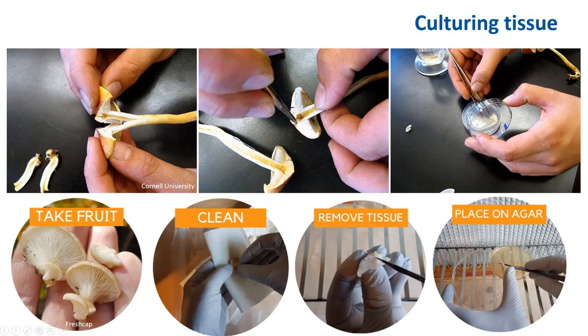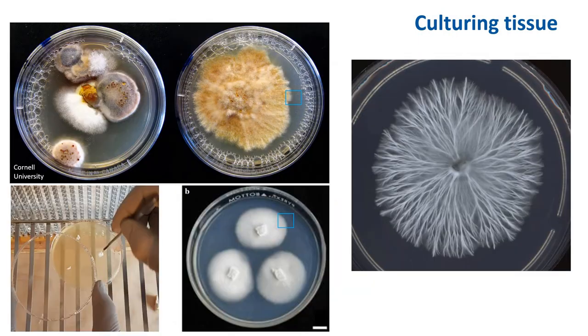Once you have the tissue, you transfer that into an agar plate. Once you have a successful colony like this, there might be underlying contamination occurring underneath that you can't see. So you want to transfer from the hyphal tips into a new plate. Generally when I do this, I put at least three to four pieces of mushroom tissue onto a plate to save plates, wait until that grows out, and then transfer a hyphal tip onto a new plate.